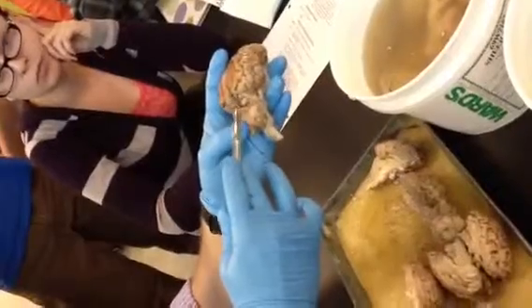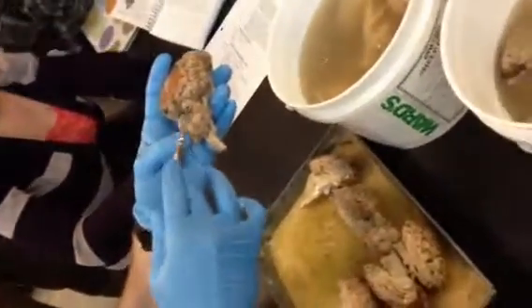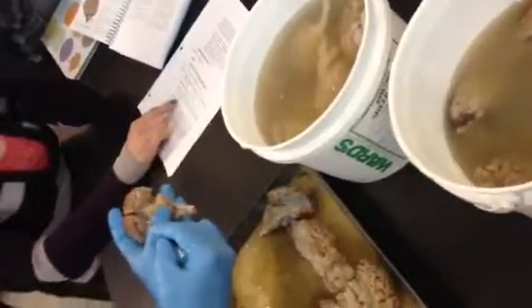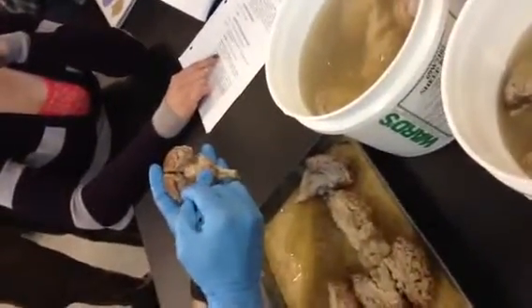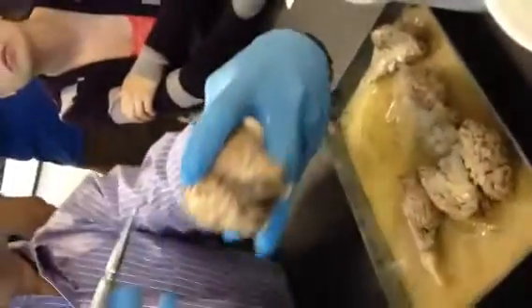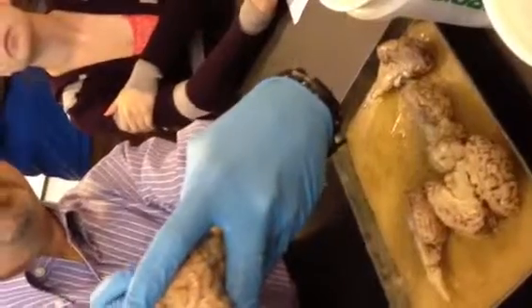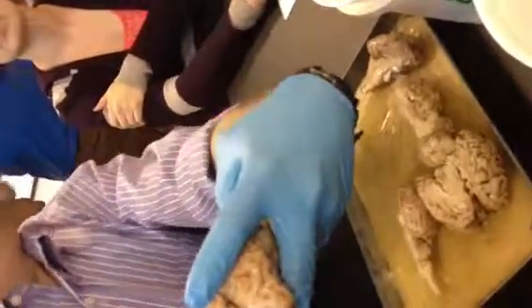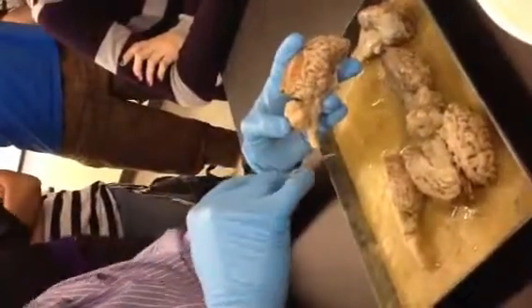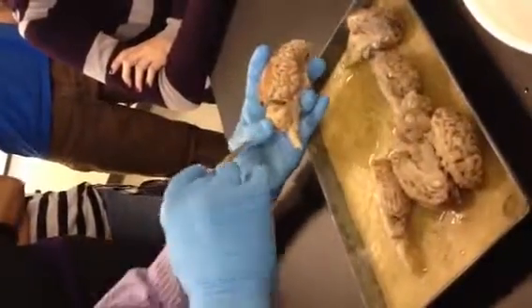If I fold this down, you can see there's two bumps there, and then two bumps right there. Those are the corpora quadrigemina. Bump, bump, bump, bump. The two upper ones are called the superior colliculi, and the two lower ones are called the inferior colliculi.